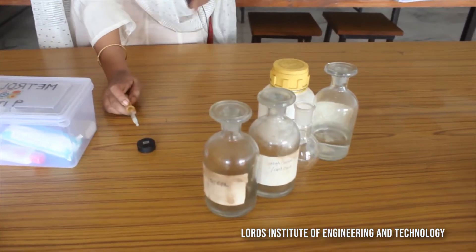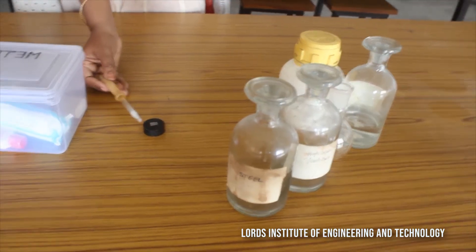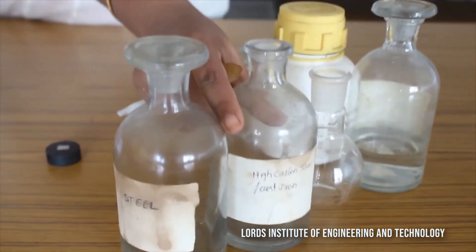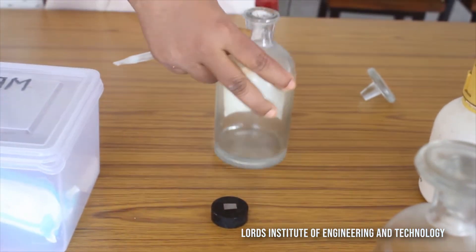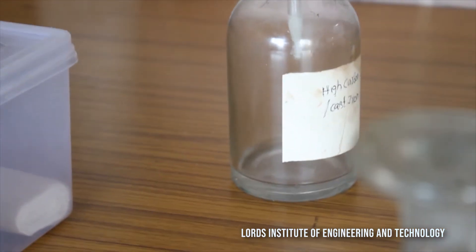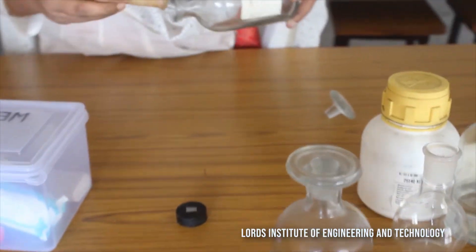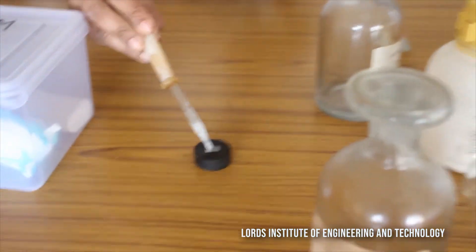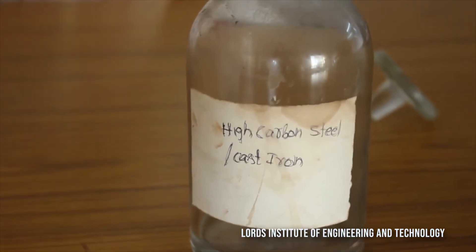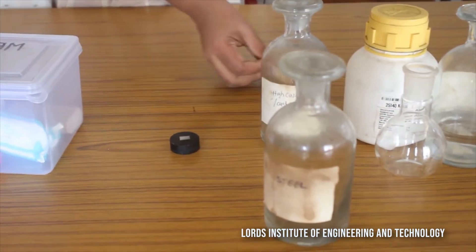We have gone through grinding, polishing on the disc polishing machine, and on the emery papers. Before we view under the microscope, you should definitely apply the etchant. This etchant is for cast iron; for different metals, non-metals, and alloys you have different etchants. You fill the dropper with the etchant and apply it finely on the surface of the particular specimen. After this, we will proceed to view the microstructure.